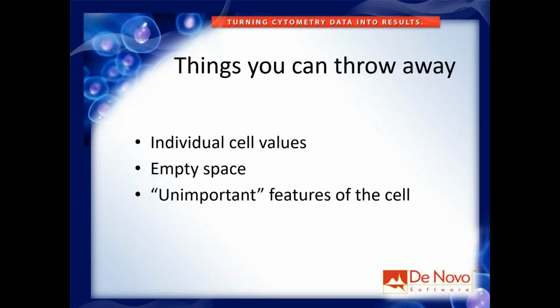So how do we do that? Well, we can throw away individual cells. If I've got 1 million cells, that's a lot of data to deal with. Is there a way to distill that down to maybe 2,000 cells and analyze those? Or I can throw away the empty space. I have 10 trillion bins; if I can throw away the bins I'm not using and only focus on the ones I am using, maybe that can help me.